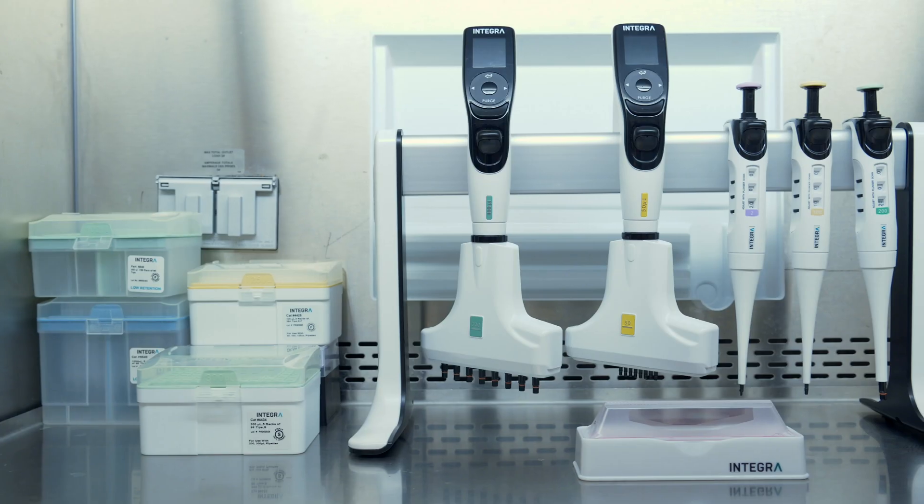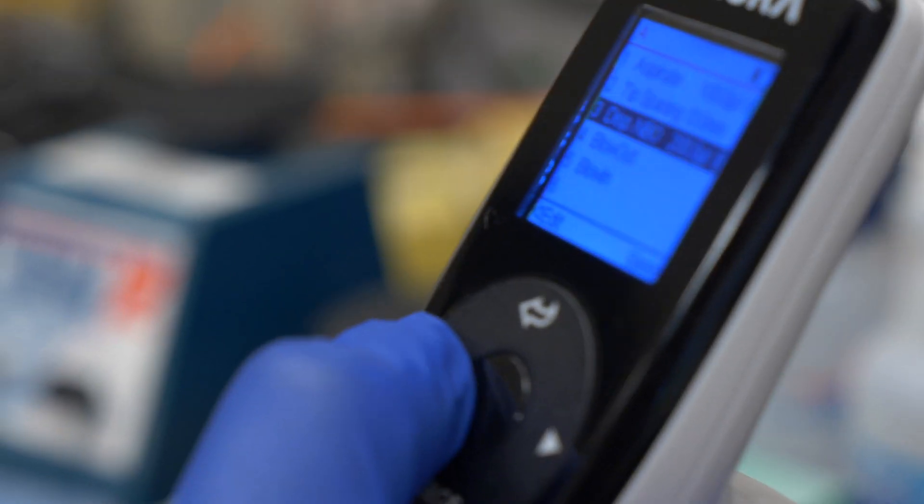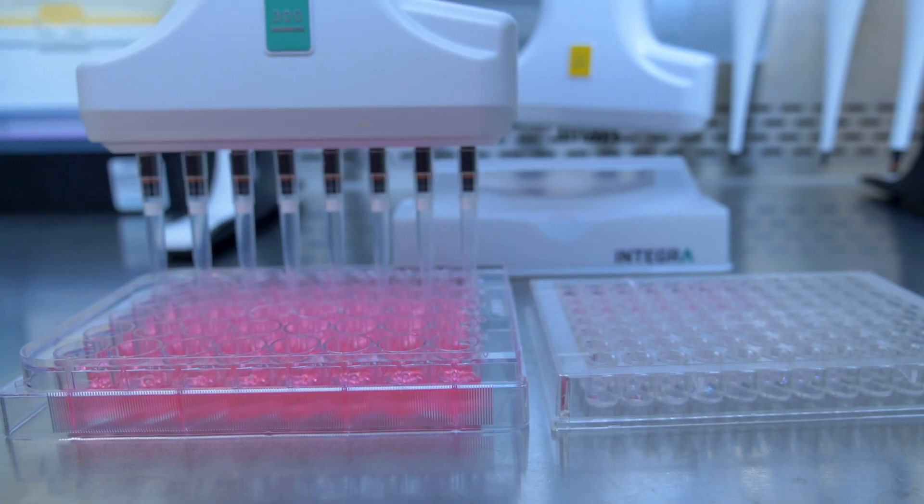I chose the Voyager because it was the only pipetter that could change the spacing with the push of a button. The competitive products required two hands and turning a dial.